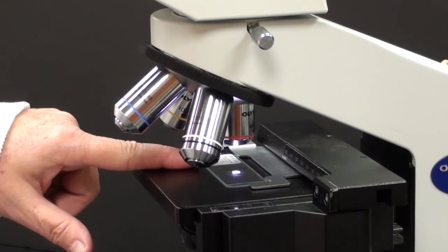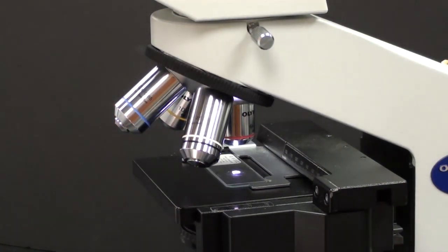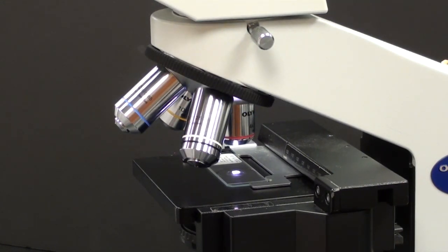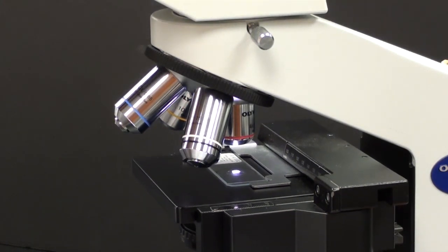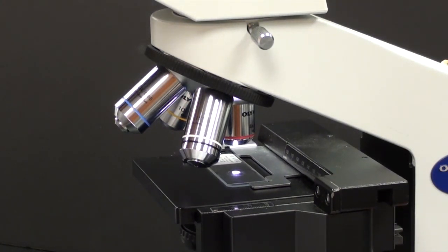I have placed the slide on the stage and I've taken the time to center the specimen over the light. What I need to do now is use the coarse focus knob, bringing the specimen almost into focus. I'm going to do a small amount of adjustment, making it perfect with the fine focus knob.